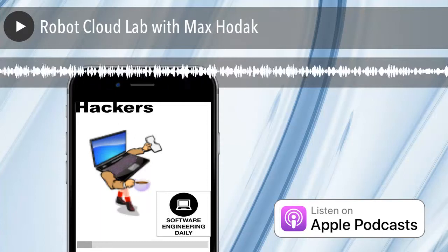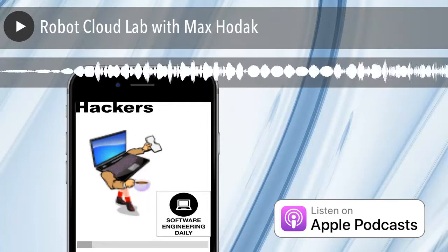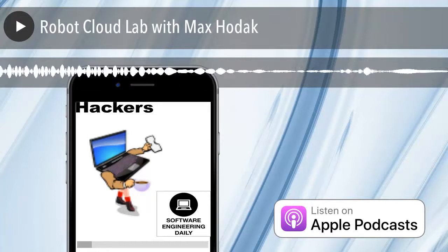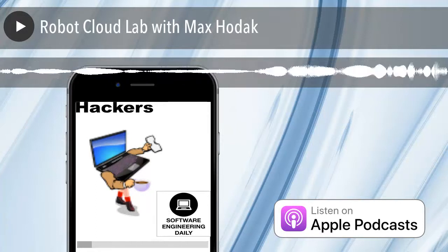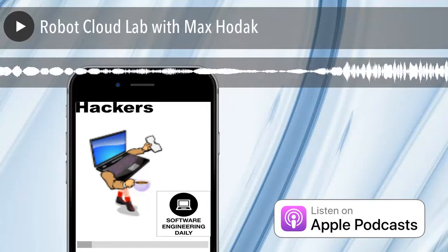So the work cell that you're describing, I've seen pictures of these. Like you said, it's like a shipping container, but it's transparent, and inside it there are machines like a PCR machine and pipette trays. I don't remember the terms for these things. And then you have a robotic arm that is doing a lot of the work.